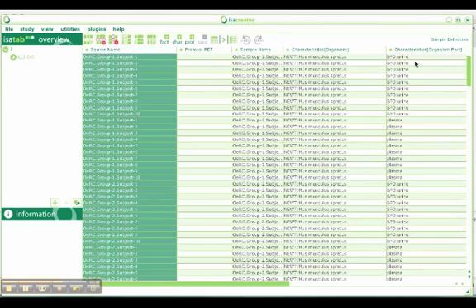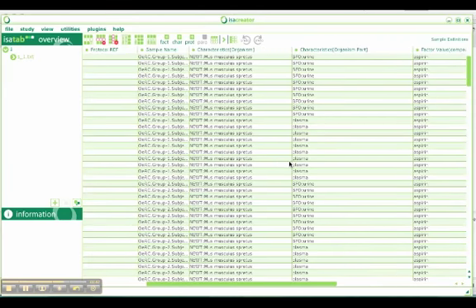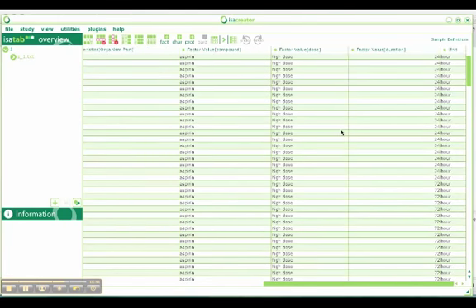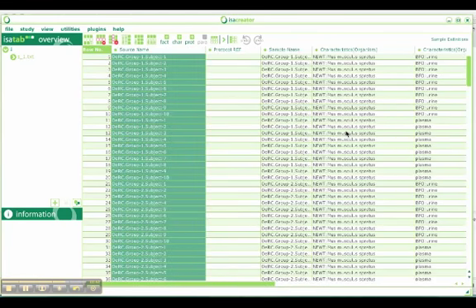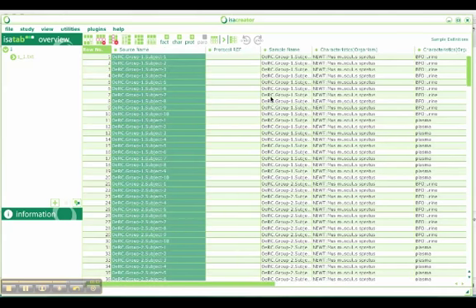Brenda tissue ontology has been used, and plasma was free text. And there you go. You've got very basic information, but key information about your experimental design, and you can start filling up the gaps.